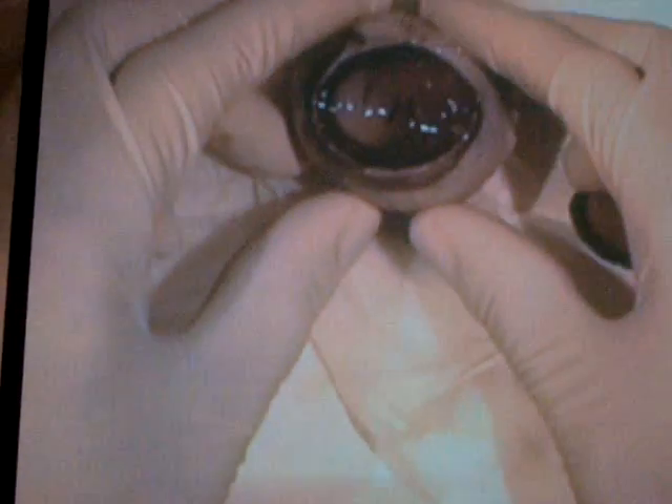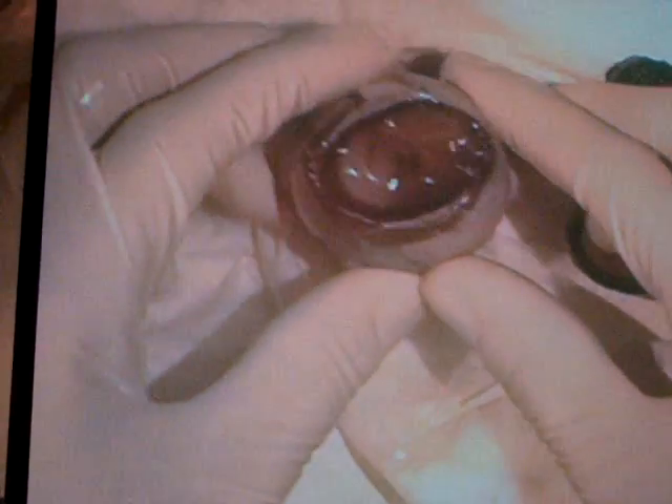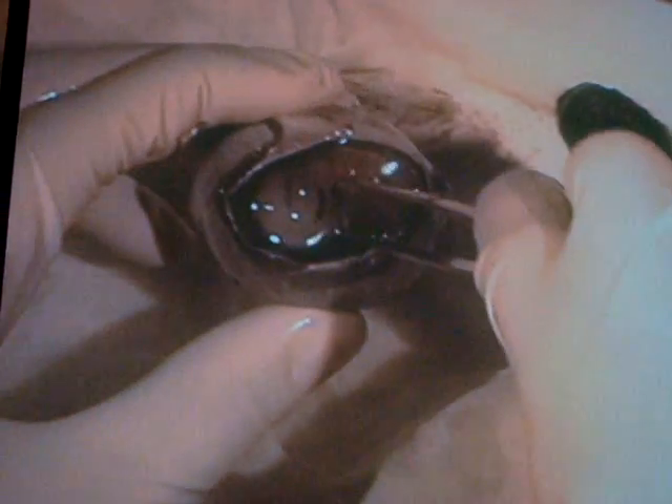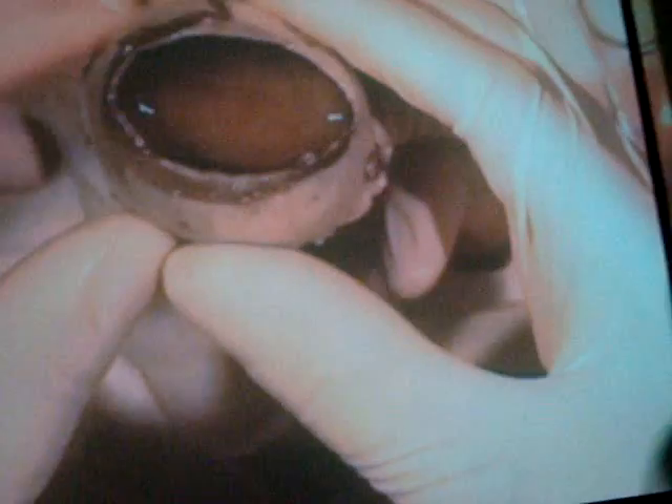Going further inside the eye, we can see what's there. There's an egg-shaped object — we'll come back to that. What you're looking at now is the jelly-like substance and the watery substance. The watery substance is the aqueous humor — most of it is gone now. But this jelly-like substance is the vitreous humor.